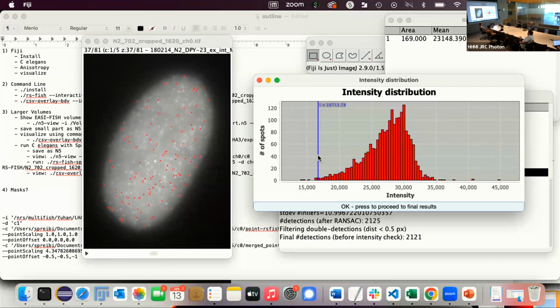The signal after. Well, I'm just wondering because right now you're doing two things: you're detecting spots, but you're also using the same image for intensity calculation. So some might just want the localizations and then use maybe a really raw, unprocessed image to get the original signal. But you could do this, right? You get the location. Yeah. I mean, you can easily do this yourself, right? You have to parse the CSV and basically go there and get the intensity out. I always thought that many of these things you can use and do something else. Yeah, you have all the positions.